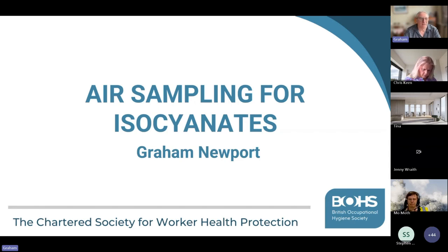I'm going to start things off by having a look at the recommended method for sampling for isocyanates, looking at the main drawbacks that we get when using it. I'll also be talking about how the GAL fits in with this procedure and look at some of the most recent changes that we've made to the SOP that you need to follow to ensure we're complying with a license.